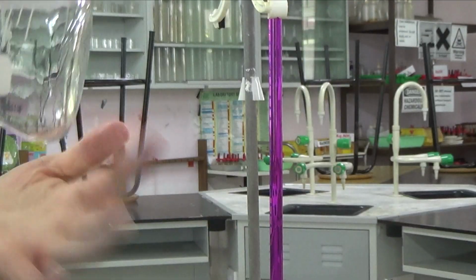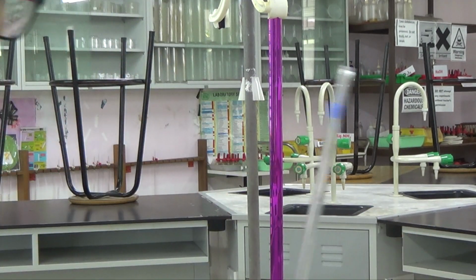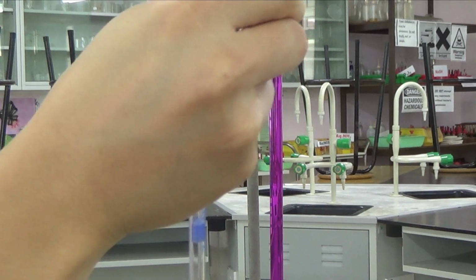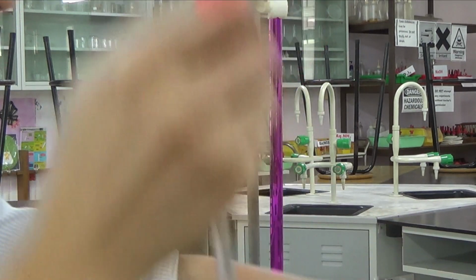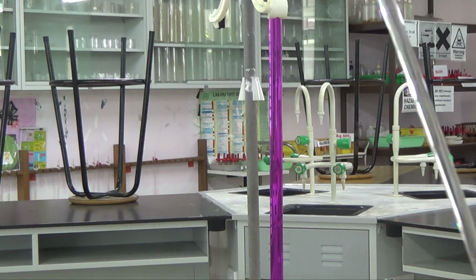A little bit of distilled water left in there will not affect the titration volume because the moles of the stuff that you pipette out is unaffected by the amount of water left in the conical flask, and therefore it will not affect your burette titer at all.